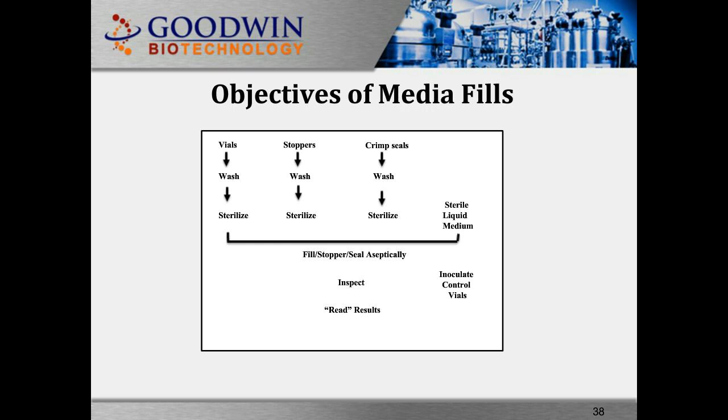At the end of 14 days, some of the control vials have to be inoculated with the microorganism in order to confirm that nothing was compromised during the fill, to identify if there is any contamination during the fill.